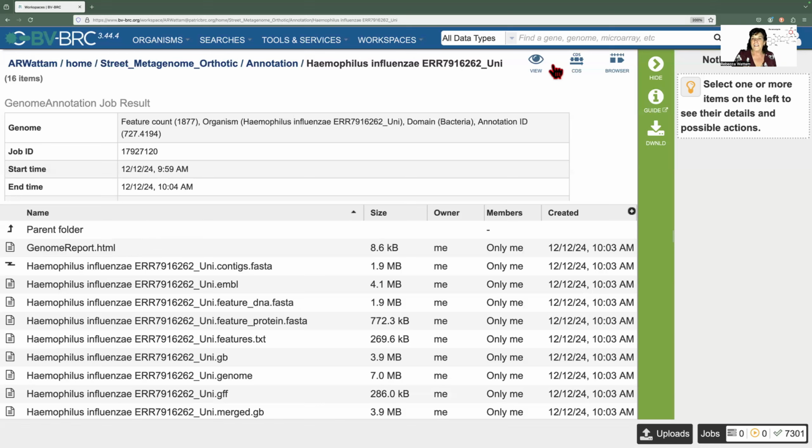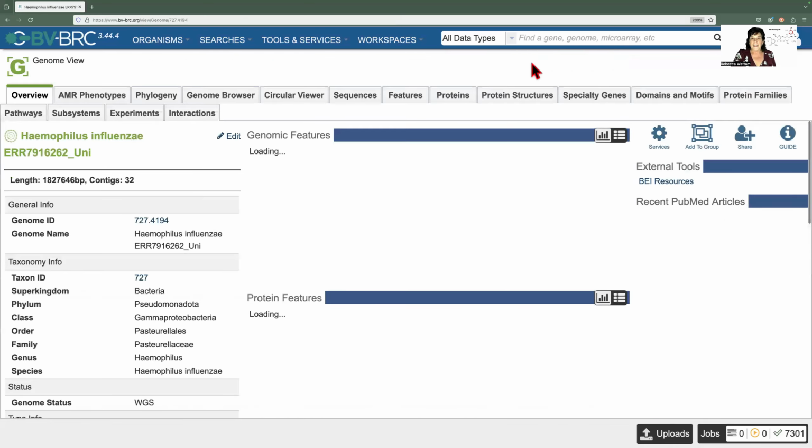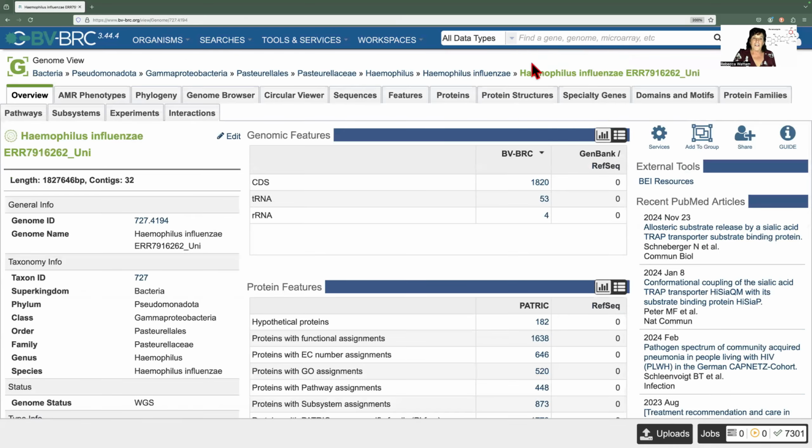So we're going to finally look up here at these three icons that are hyperlinks to your private data. One is the genome landing page. One is the feature page for all the genes in your genome. And one is the genome browser. I always first, pretty much exclusively, click on View Annotated Genome. So you click on that and it rewrites the page to show your particular genome.